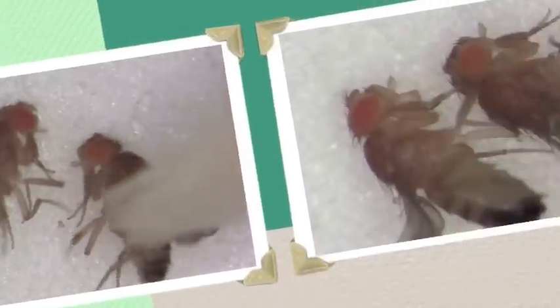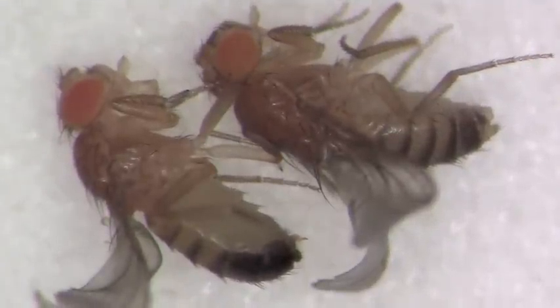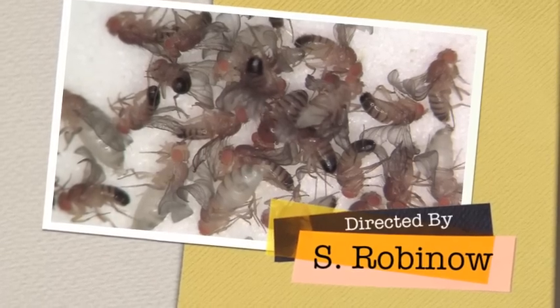Here's another pair of male and female. Note the pigmentation difference in the posterior end between the male and female.